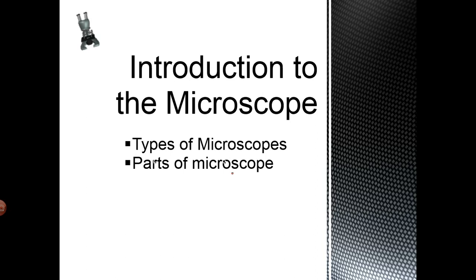And the major piece of technology that has come about or that has been refined to learn about cells is the microscope. So in this presentation you're learning about both the types of microscopes that are out there and the parts of the microscope.